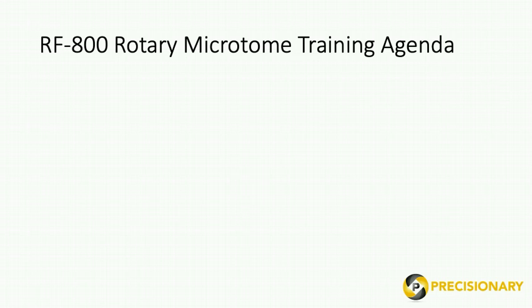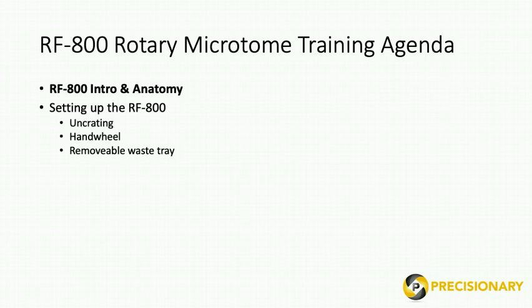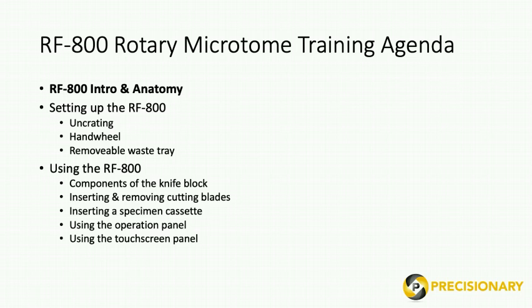Now let's see the training agenda for today. First, I will introduce you to the RF-800 rotary microtome and show you the anatomy or parts. Then, I'll explain how to unpack the microtome and uncrate it. I'll show you how to install and operate the hand wheel and the removable waste tray. Next, and this is the fun part, I will explain how to use a knife block, how to insert and remove cutting blades, and how to use the operation panel. Your RF-800 has a touchscreen panel, which is one of the newest advancements, and this allows the microtome to be very user-friendly. Finally, I will go through all the steps for cutting samples.